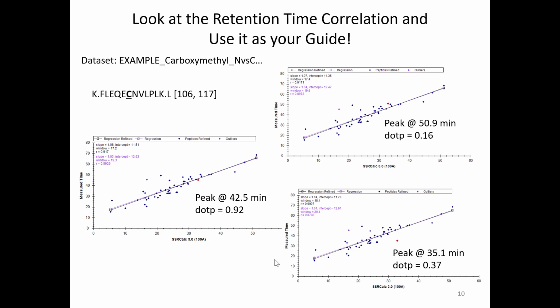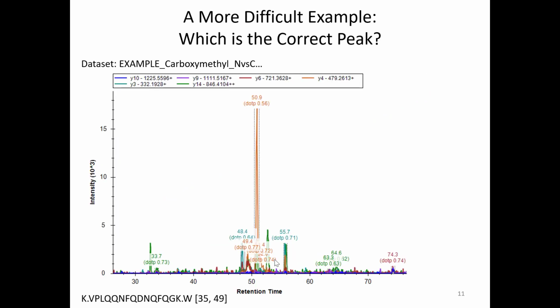How do you navigate Skyline to get to this particular setting? We will get there.